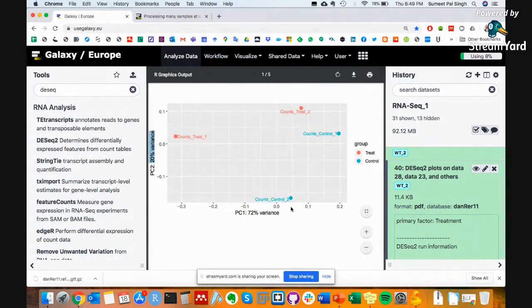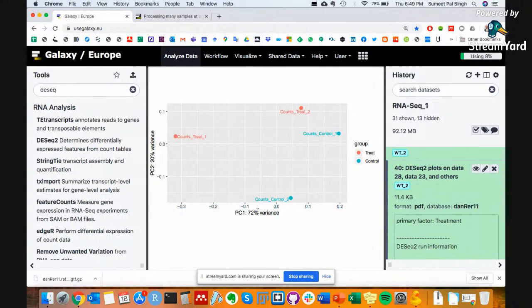Another way to say this is that the variability you see on the y-axis is going to be much lower than if points are separated on the x-axis. So separation on the x-axis in this case is more than 3 times stronger. And this is something that people frequently do not consider when they look at principal components. Each axis does not explain the same amount of variability, and it also has a different amount of strength.